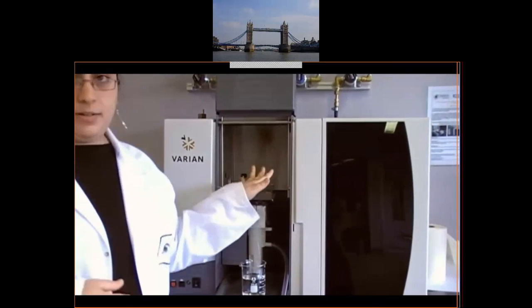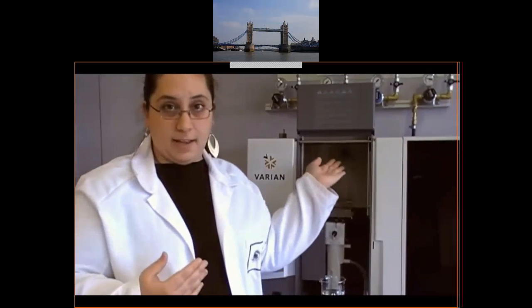Once our sample gets into our flame, 3 different things happen. First is desolvation, and all that means is that the solvent that's used to dissolve our sample is burnt off. Okay, the first is desolvation. This is in the sample introduction system or in the atomizer. Write that down. So we're left with compounds. And then the compounds break down or decompose because of the really high temperatures. And then we have free atoms and ions, which are up there in our flame.